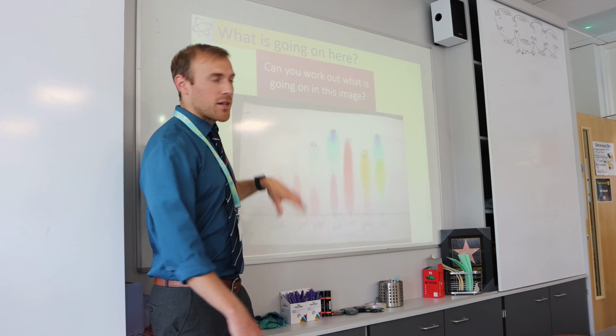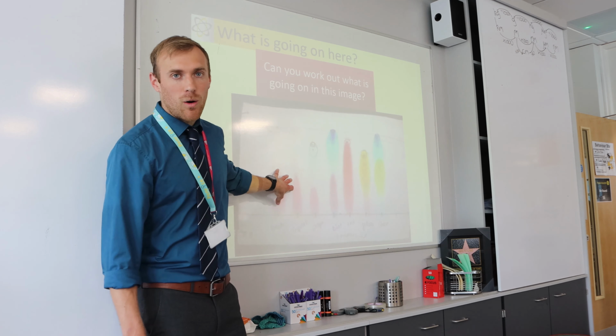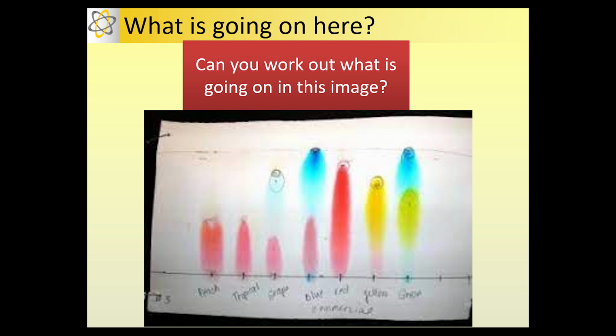Right, so the next thing I'd like you to do is have a look at this image that we've got on the screen behind me, and I want you to think about what is actually going on in this image. So we've got some different colours here and what's happening to them as they are going up the paper.